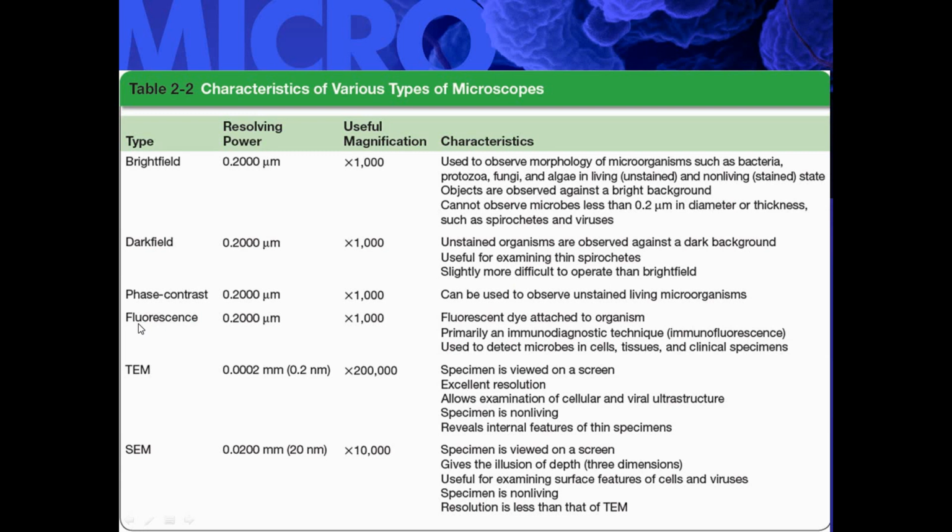And lastly, in fluorescence, a fluorescent dye is attached to the organism, primarily an immunodiagnostic technique, immunofluorescence, used to detect microbes in cells, tissues, and clinical specimens.